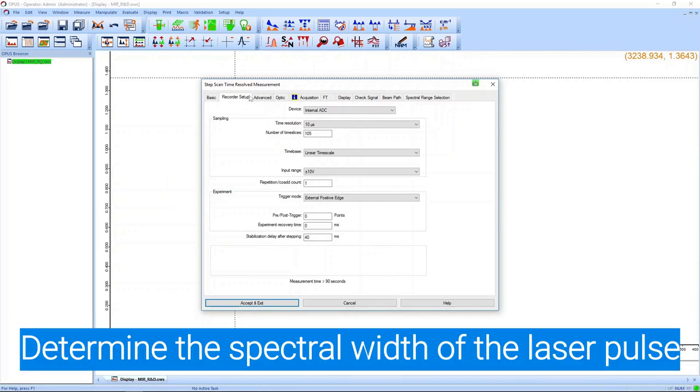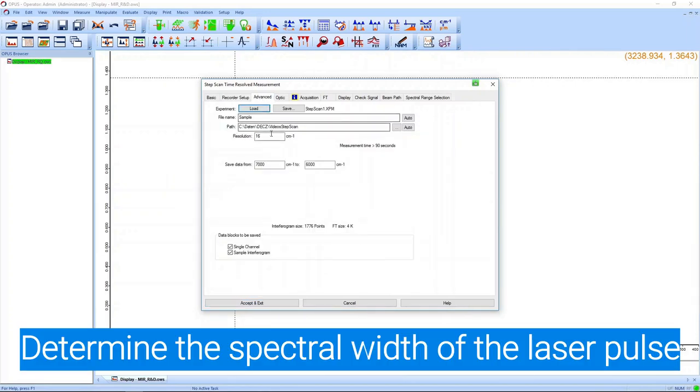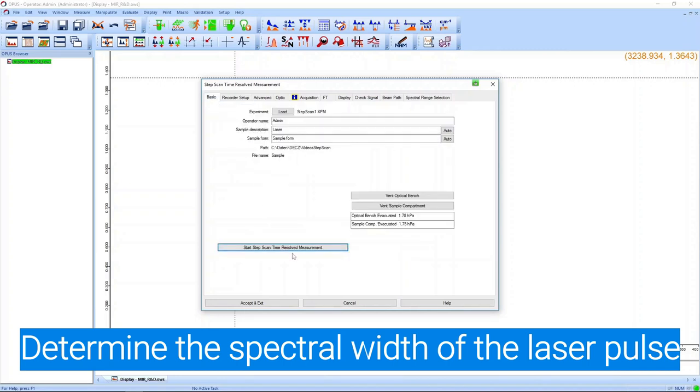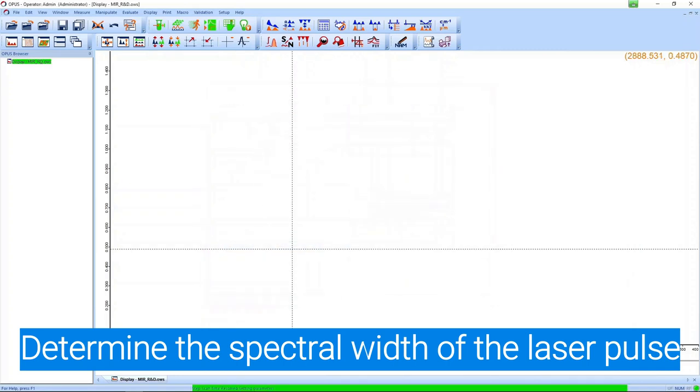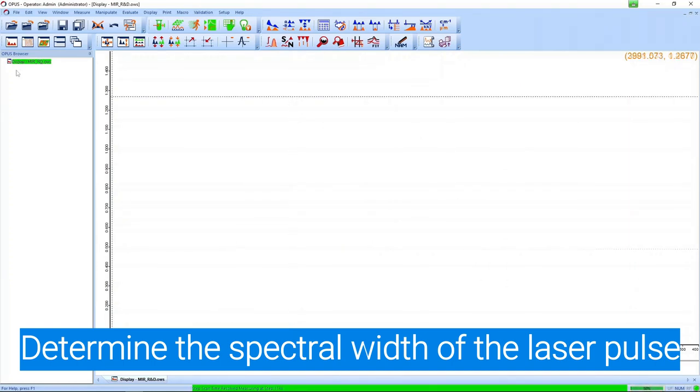In the recorder setup we can choose the time settings. We use microseconds because we know the pulse sequence is in the kilohertz regime. We use a 16 wavenumber spectral resolution which makes the measurement last for a few minutes. We accelerate this a little bit.